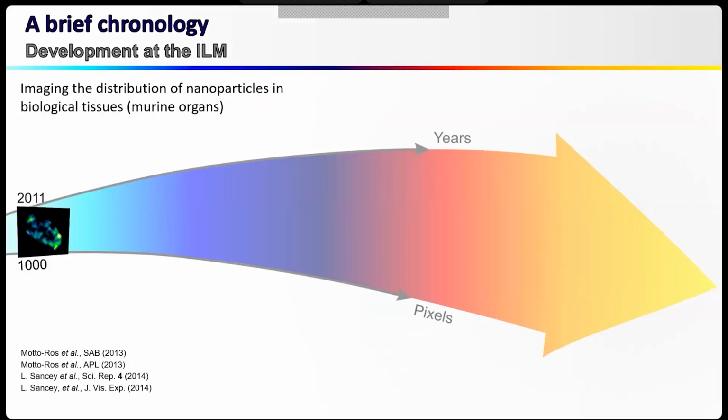Okay, this is garbage for sure, but at this period, we were very happy. Yeah, we detect gadolinium in the kidney. This is mouse kidney. And the biologist colleagues, they were, oh, yeah, this is very nice. And then they disappear.